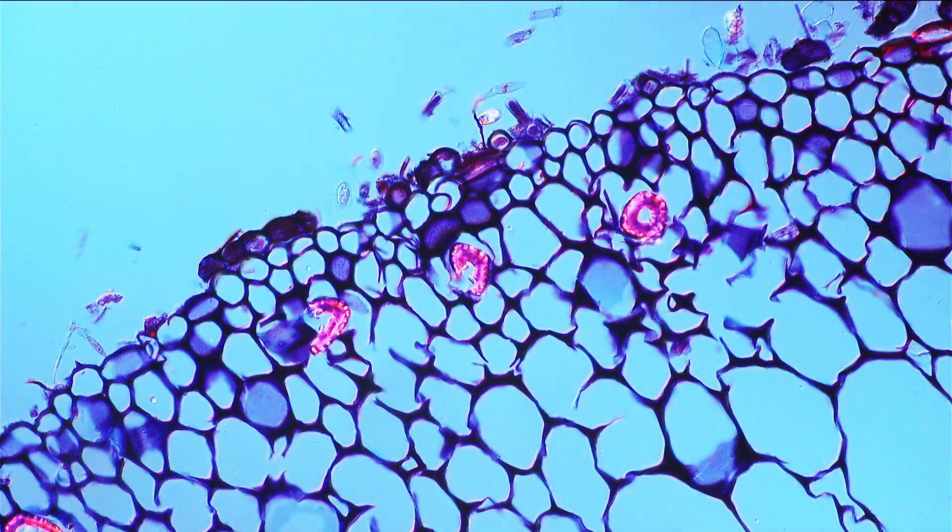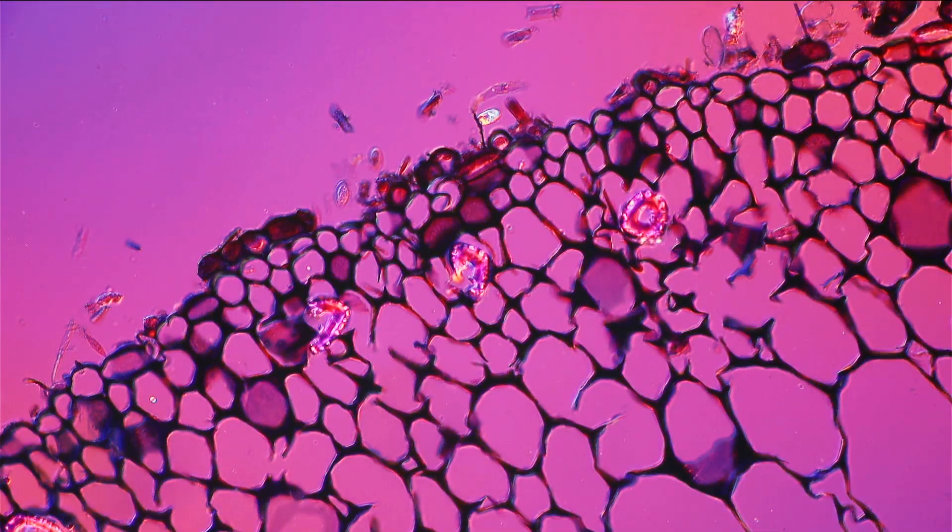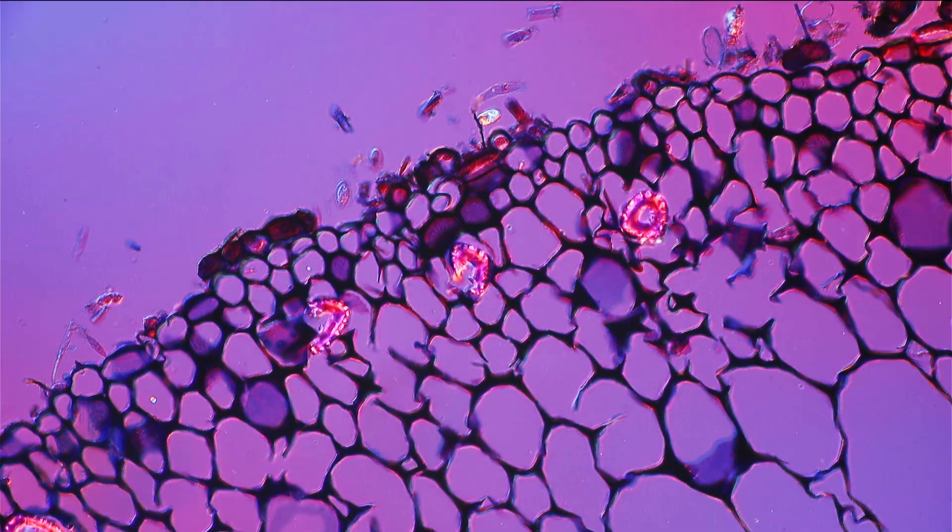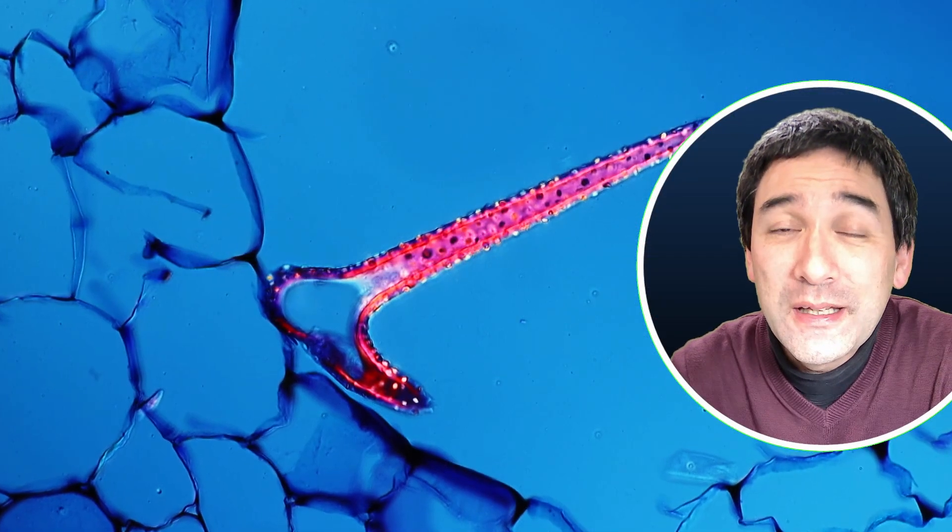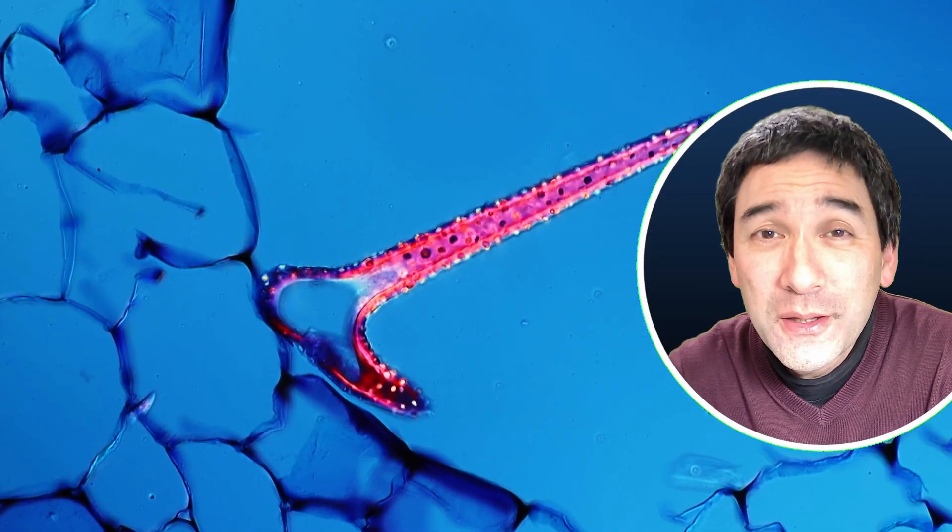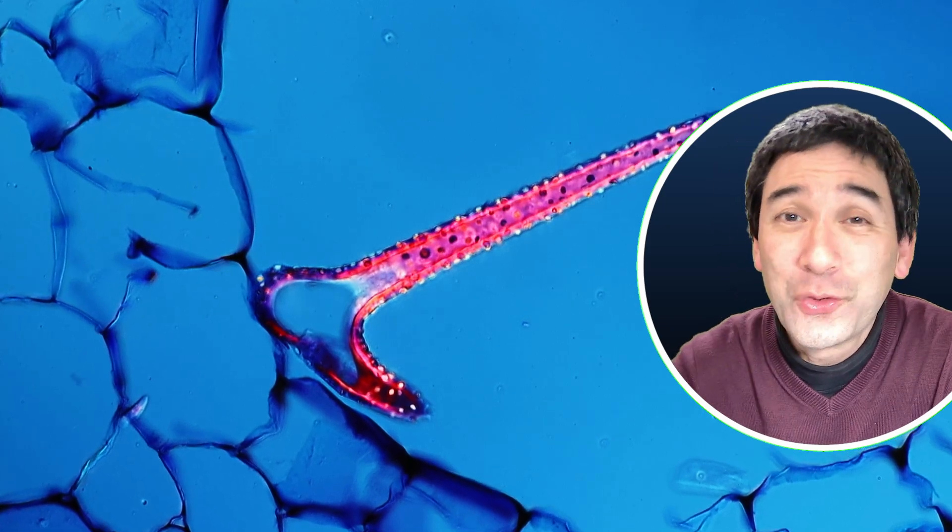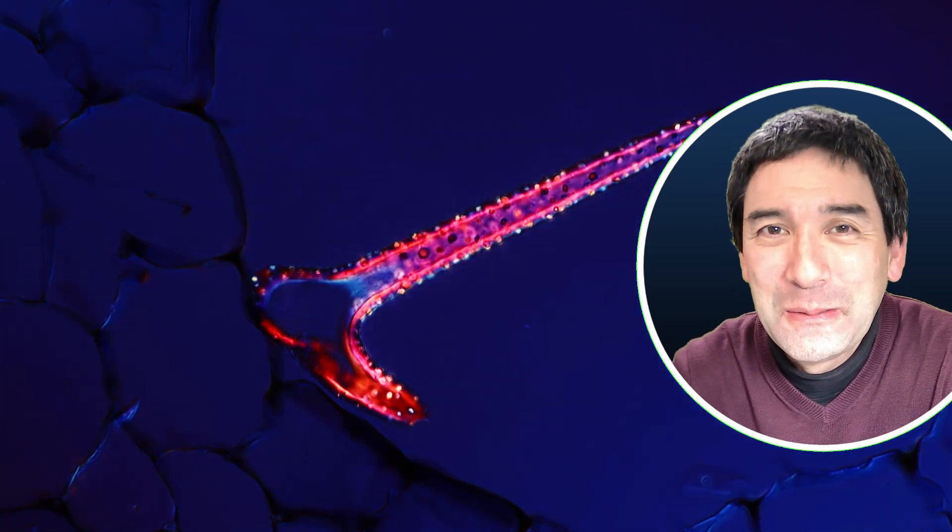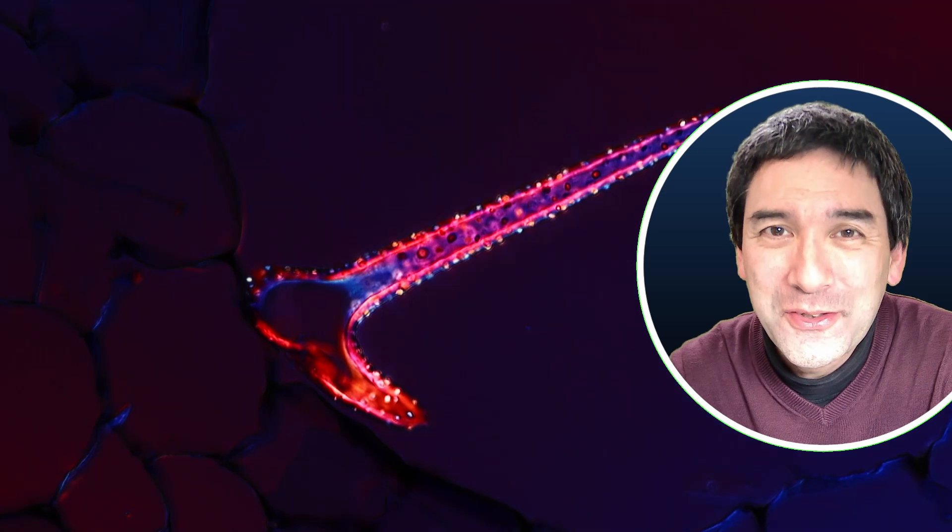Why does the color change like this? Well, in my microscope I do have a prism. I have polarized light and I'm also able to change the position of a prism, the so-called Wollaston prism that I've included. This allows me to change the background color and also the color of the crystal, so I'm able to add a little bit of additional color this way.